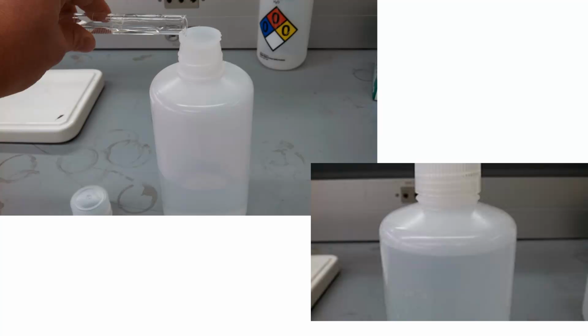Okay. Now, all of this is very inexact for a class called analytical chemistry. And the reason is, we don't need to make it perfectly because we're going to find out the concentration of sodium hydroxide in that bottle in the next step. The way we're going to do that is by titrating KHP, a known amount, with our titrant.